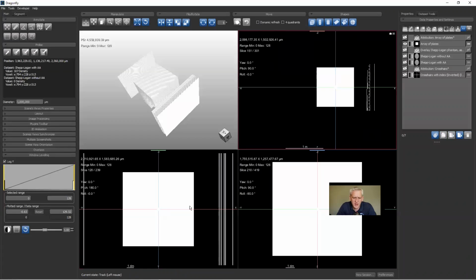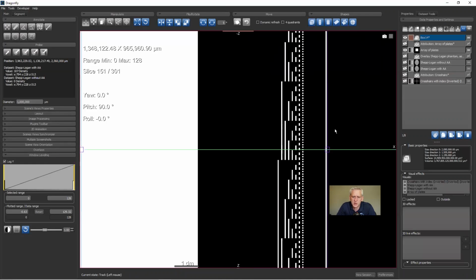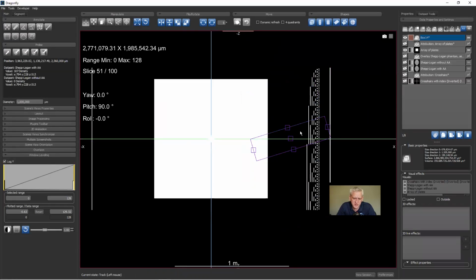So we have this data set. If I were to use a shape and extract something out over here, so let's turn on a shape. Let's get the visual box going. And let's say I want, for some reason, and we saw this with a cell phone example in lesson 7, you may want to get a box that's just right for the size of your shape. Now, it doesn't match the size of this shape, but this is just an example.